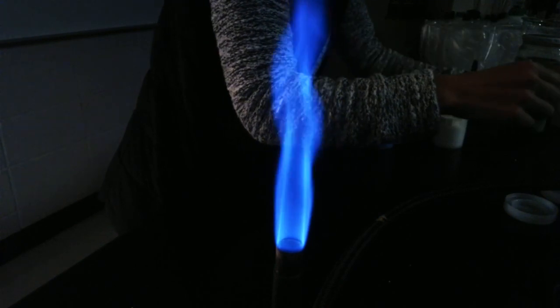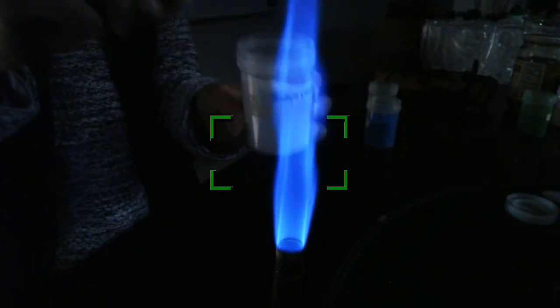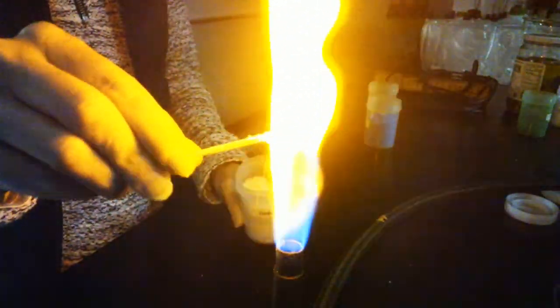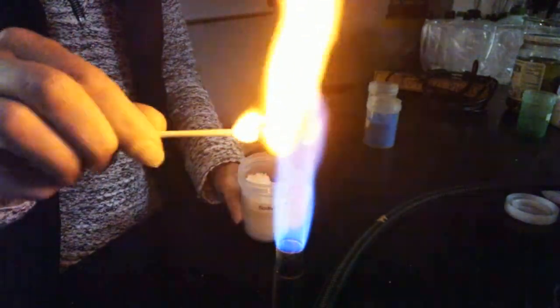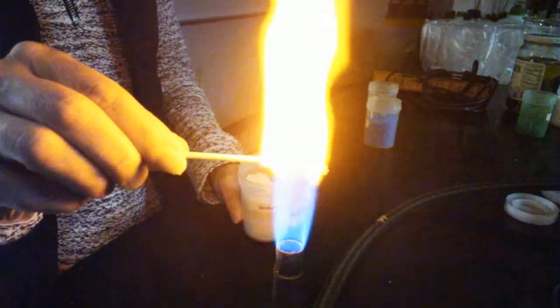Pretty cool. I have one other one. If we don't see a good color with this one's sodium chloride. Here it is, sodium chloride. I've got another option, if we don't see this one great, with the sodium chloride. It is kind of a bright orange. It's kind of cool. You can see that pretty nicely. So orange, maybe a lower energy color, lower energy transitions up and down the energy levels. Gosh, that's so cool. It's mesmerizing and I'm having so much fun. I hope you're having just as much fun watching me.